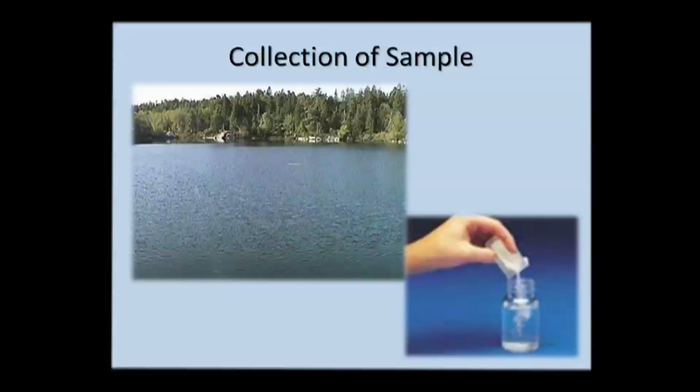First one, collection of sample. The requisite specific site must be selected according to the sampling and analysis plan, SAP, and a representative sample must be collected.